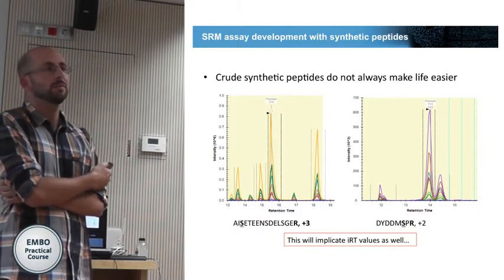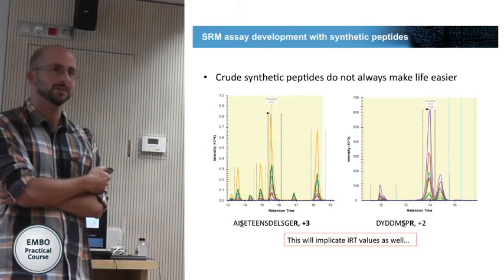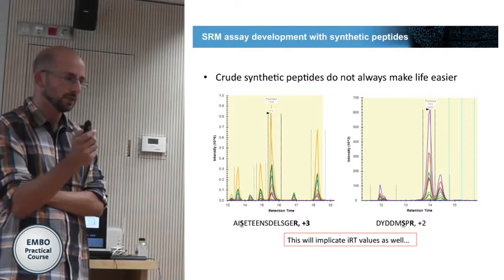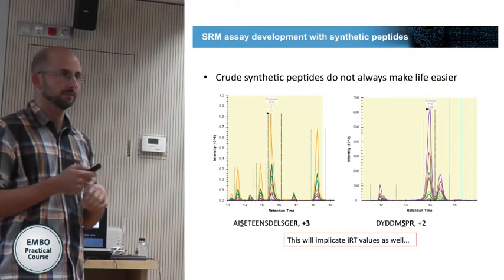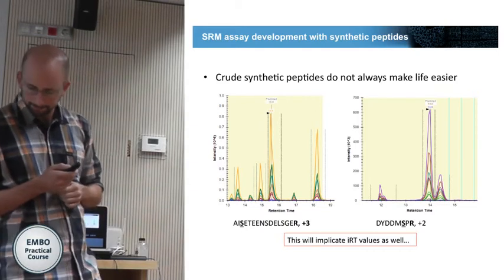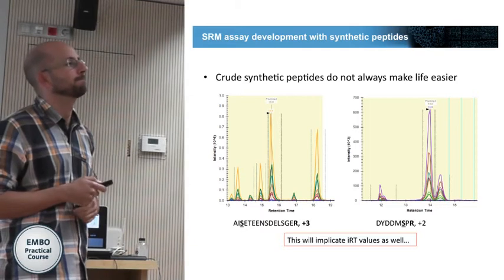So it's a crude heavy peptide. We would like to hope that the company knows where they're putting their serine. The reason is just, it's a very relevant question. The phosphorylation is added as a phosphoserine, so there's only one place in theory it could be added. Okay. But maybe they completely messed up their synthesis. Could be one reason. What else?